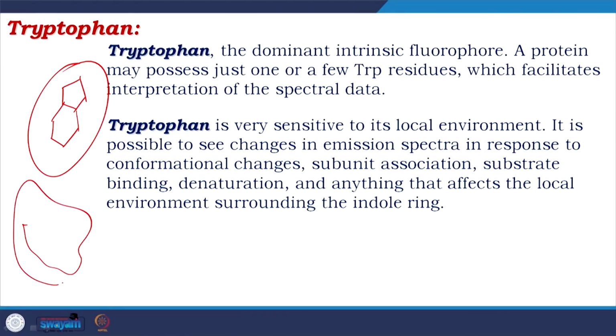Now, why is tryptophan so important? Suppose this tryptophan is present inside the hydrophobic core of the protein. Now, when you add some heat, thermal energy, or change the pH or add some denaturing agent, what will happen?